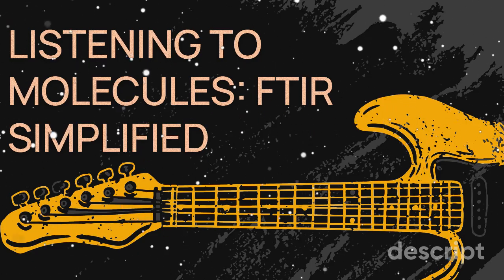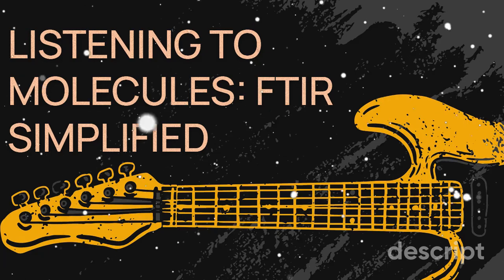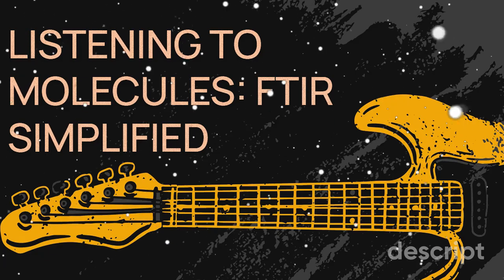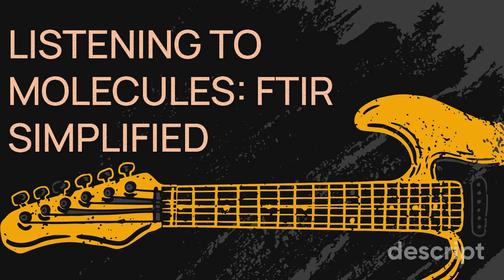So it's kind of like how a wine glass will shatter if you hit the right note. Yeah, exactly. But here we're talking about molecules absorbing those specific wavelengths of light. And by measuring which frequencies are absorbed, we get a unique fingerprint for each molecule. And this fingerprint tells us what the molecule is, but it also reveals clues about how its atoms are arranged. Its structure. Its structure, exactly.